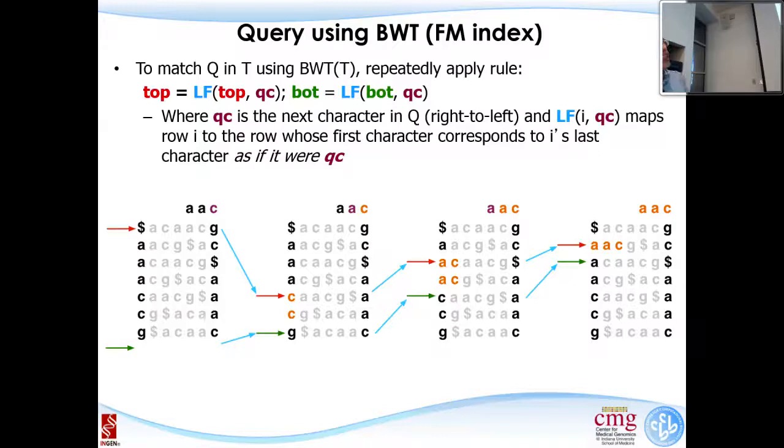Okay, so you can read this. I don't care, and I never read this. So let me try to figure out what this means. So now I have this, which is GC$AAAC. You can think of this as my index. This is my reference genome. My reference genome in this case is short. I have 6 letters. I should have 3 billion letters of this. Now I have 6, just for demonstration purposes.